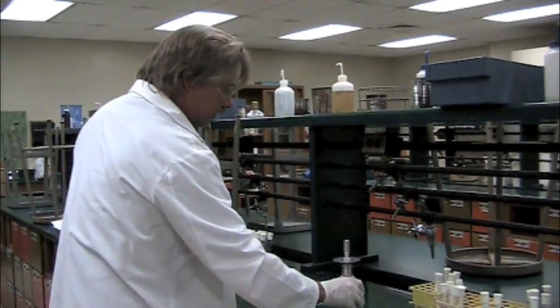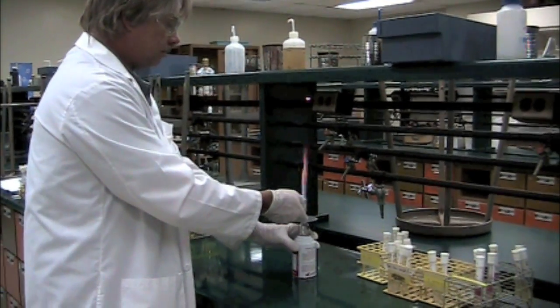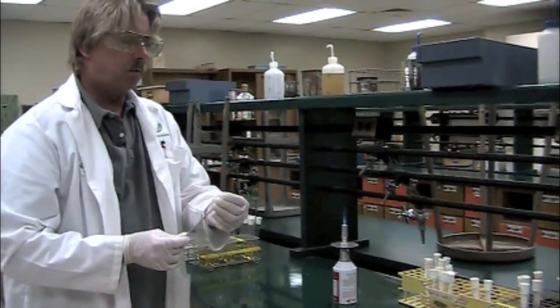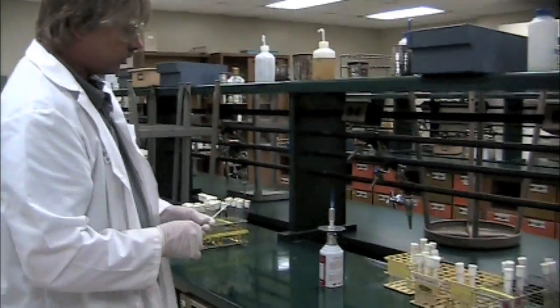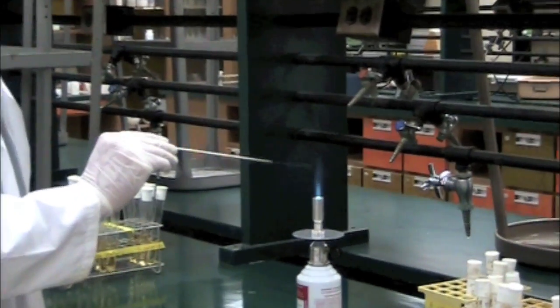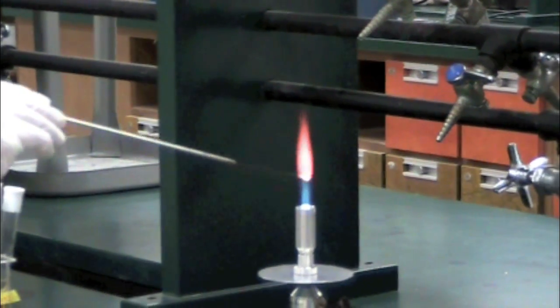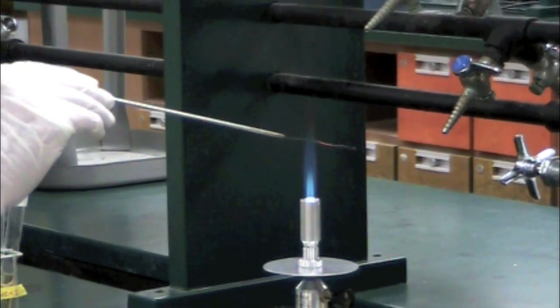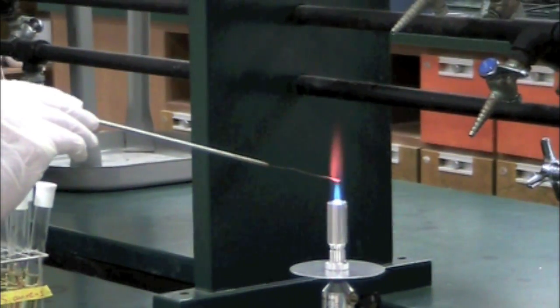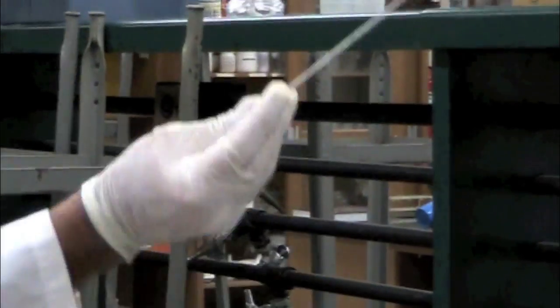So what I want to do is get my heat source here. I'm using a little butane torch today. My wire inoculating loop. Okay, the first thing I need to do is sterilize my loop. So I'm going to get in the flame, and the hottest part of the flame is always at the very tip. Here you see the hottest part is right at the tip, this deep blue in the middle there. You want the wire to glow red hot. Okay, I'm going to even get up on the stem a little bit. Okay, that is now sterile and also very hot.